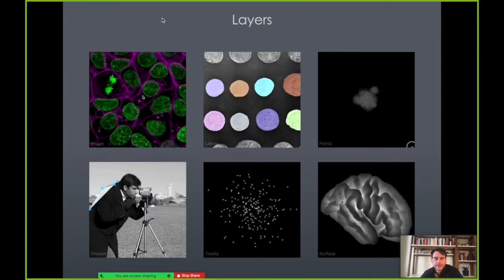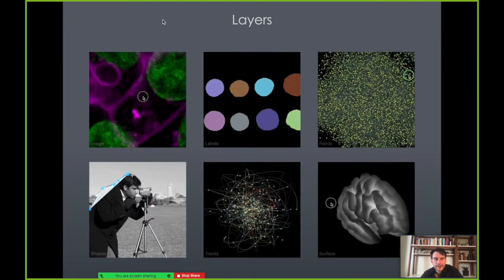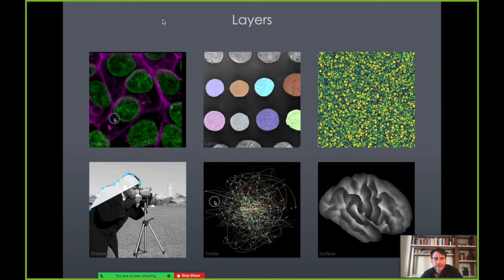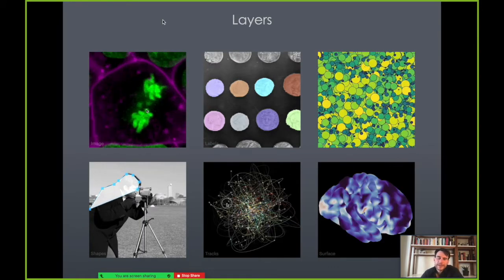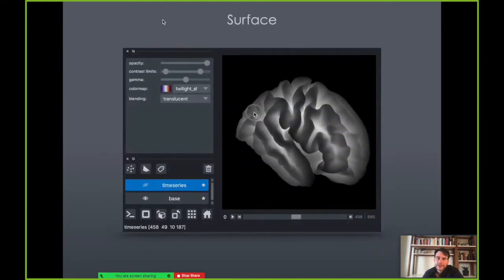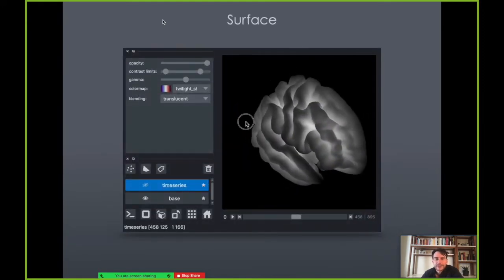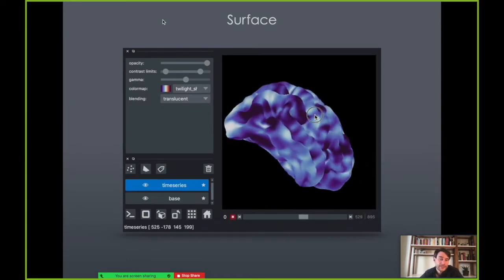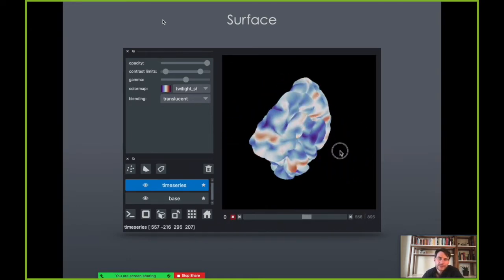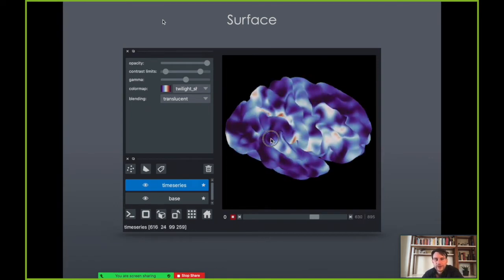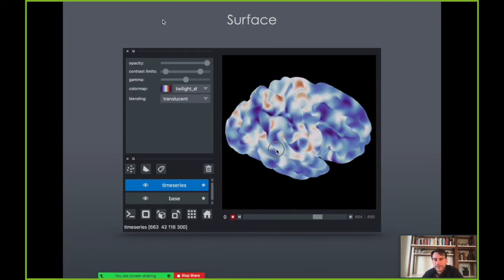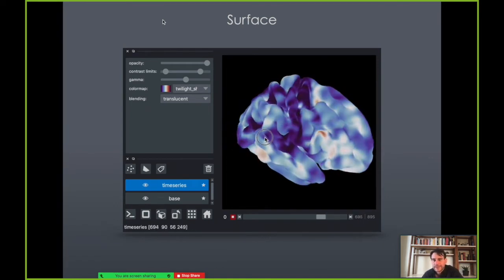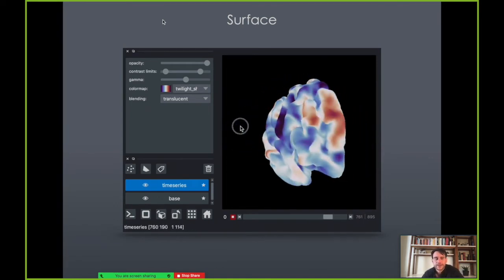Our next layer type is surfaces. Here you can see a mesh representation of a brain cortical surface. We can even have a time series of surfaces, showing changing values from measurement of brain surface activity represented in Napari.